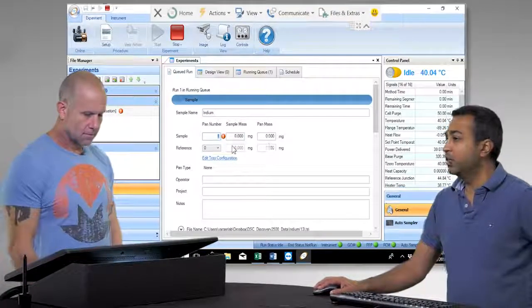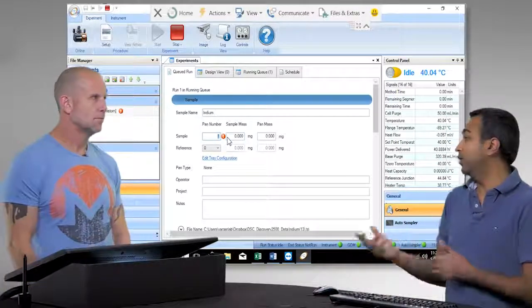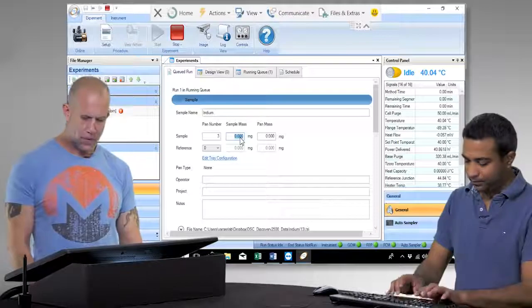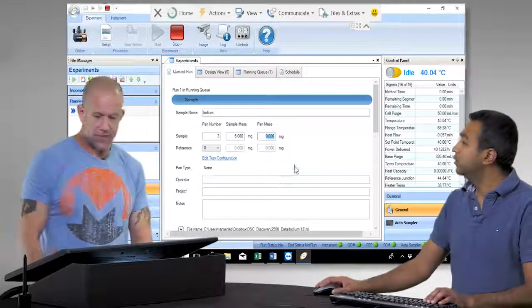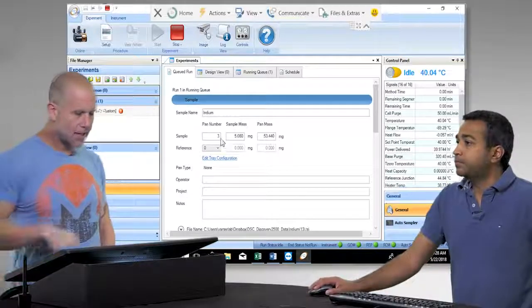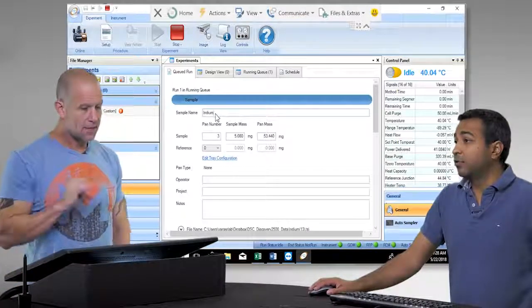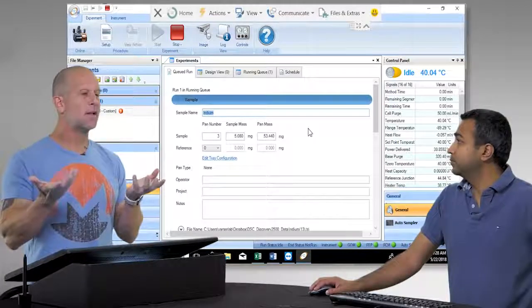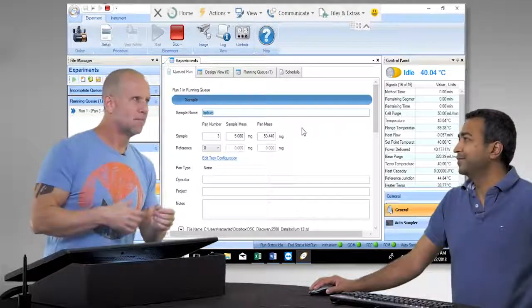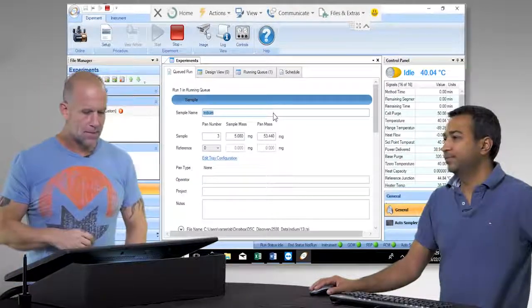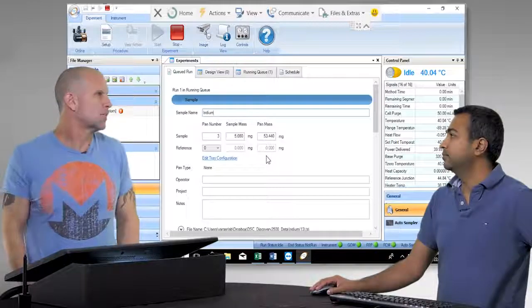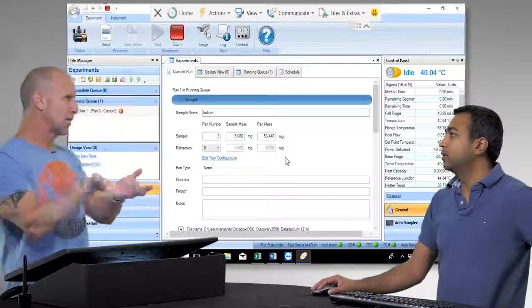I'll put in the sample name 'Indium.' Then you put in the parameters for where your sample is, the sample mass, and the empty pan mass. We're at sample number three. The sample mass is 5.08 milligrams and the pan weighs 53.44 milligrams — that's the aluminum pan and lid used to hermetically seal. This is also going to be used as the file name. I like to use underscores because certain file systems don't handle spaces well. Making sample names that are fairly descriptive is always useful.